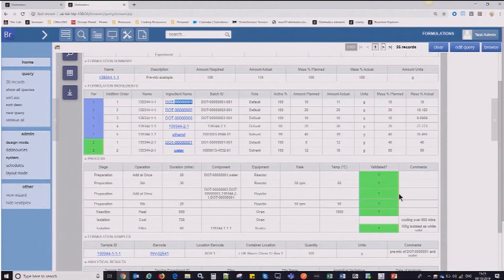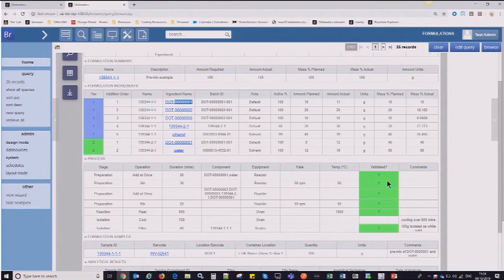What's nice to show here is the validation step. The use case here is that you may define a particular process that you'd like a technician or a scientist to complete, and then they can mark it off as completed as per the requirements, or whether there had to be a deviation from that particular step.